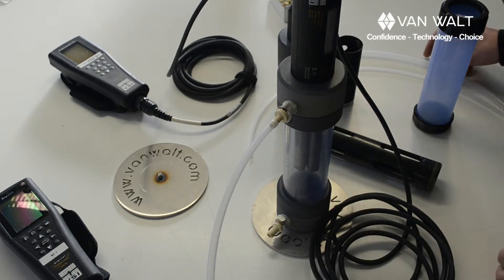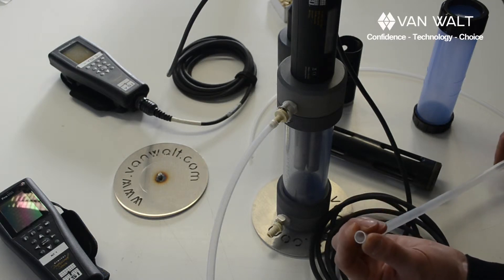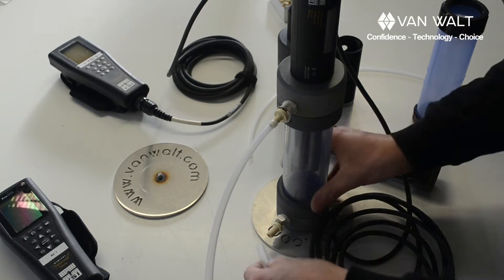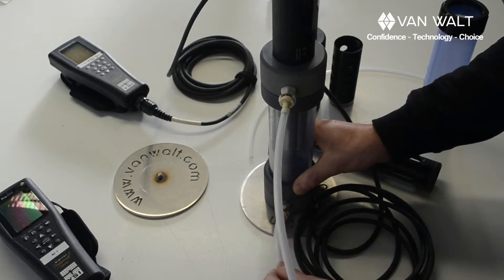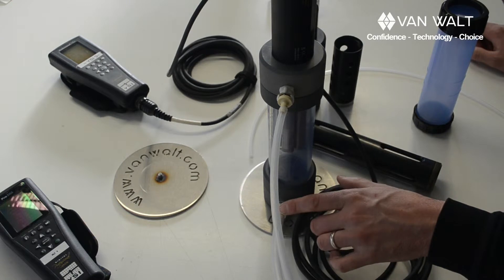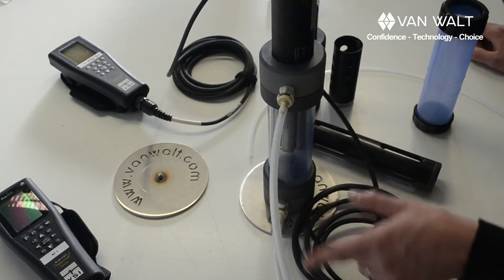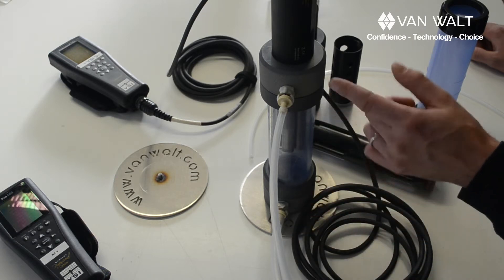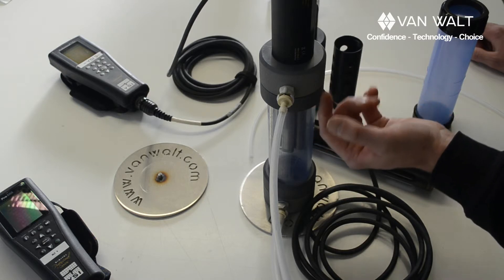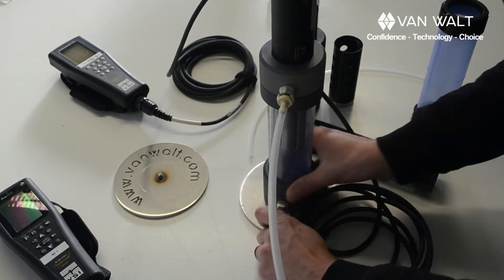If you are using a geo sub pump you might be using this tubing — this is ten by twelve millimeter — which will fit directly onto the larger barb. But don't forget: if you're using a high flow pump like a geo sub, keep the flow through the cell low. If you go high flow through this you stand a chance of pressurizing the cell and injecting water into those ports, and then it's not going to be happy.